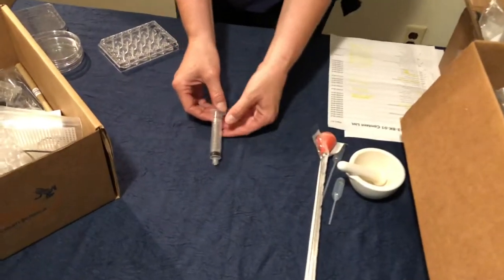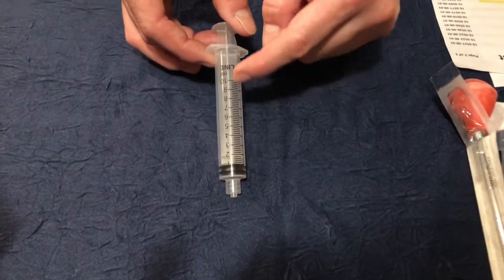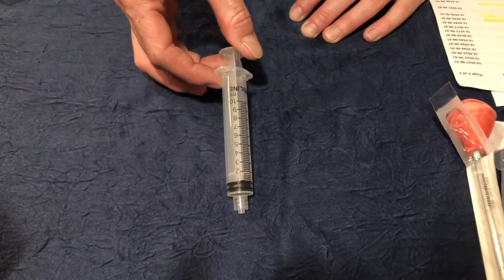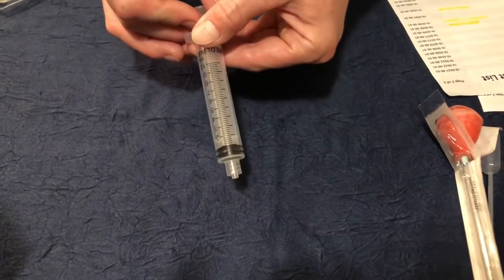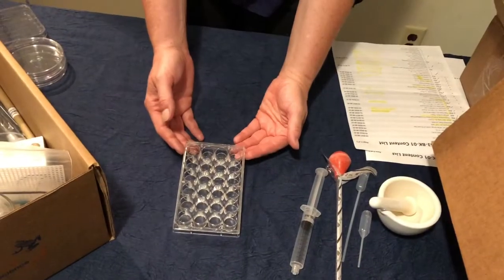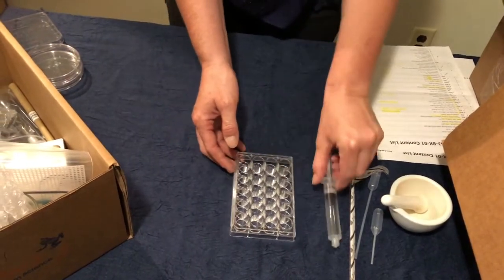This is our titrator syringe. It can take up to 10 milliliters of liquid. It has a vacuum, so it's a little tough to pull — keep that in mind when you're using it. This is our microtiter plate, which will be used alongside the syringe.